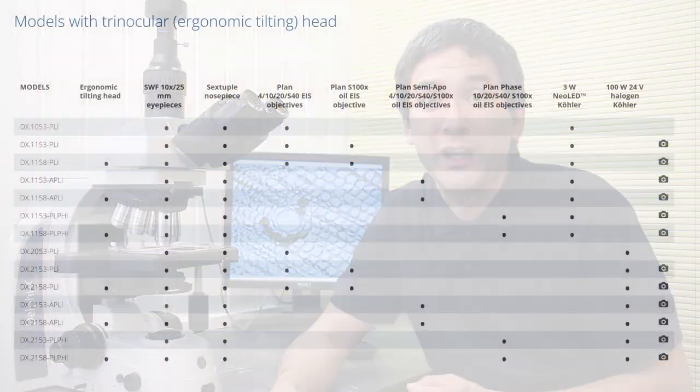So the Delphi X microscope does come in different versions. This model over here, for example, has an LED light and it's also available with halogen. Here we have all the plan objectives. All Delphi X microscopes are infinity-corrected objectives. But here we've got plan semi-apochromatic objectives. But for routine laboratory use, you can also get plan achromatic objectives and even phase contrast objectives are available. The website of the company provides all of the different variations.